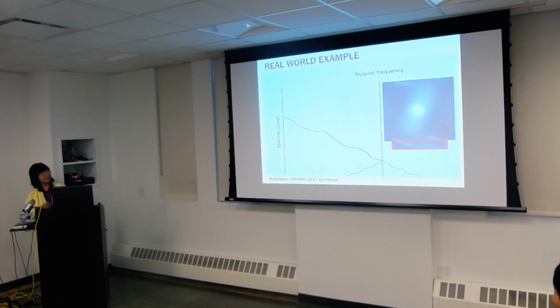So this is aliasing, and you're going to see this in your data. You're going to see this when somebody shows you imaging. You will see people arguing about how we should be collecting data and what the theoretical value is that you get. A lot of it has to do with how much you can capture in the frequency domain to describe what's in real space, and vice versa. You can have it the other way around too.